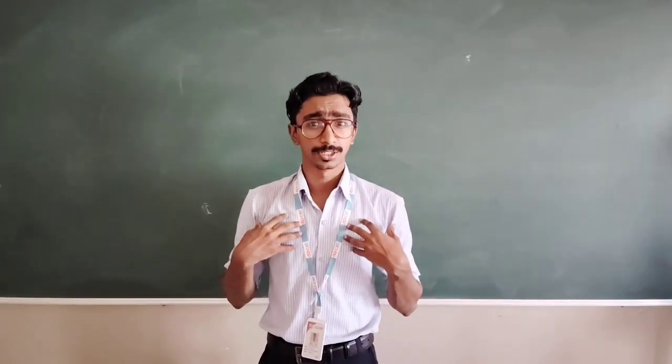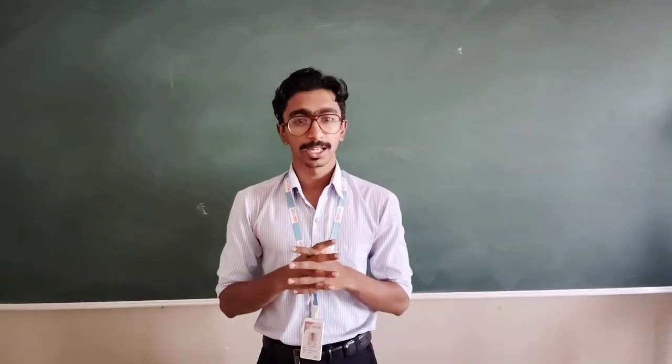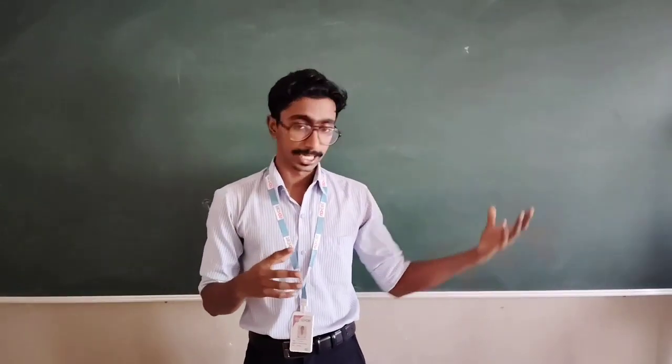Hello viewers, I'm Dheeraj Chawda, and today I'm going to do an experiment-based video about hardness. So we want to go to the hardness part.